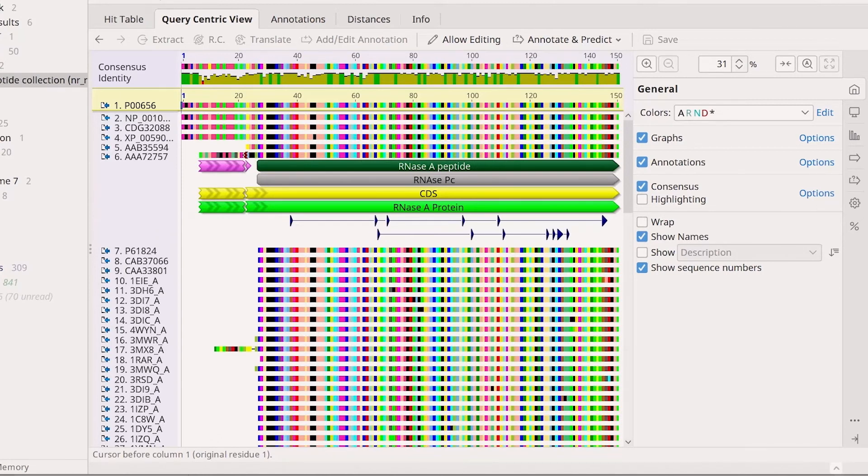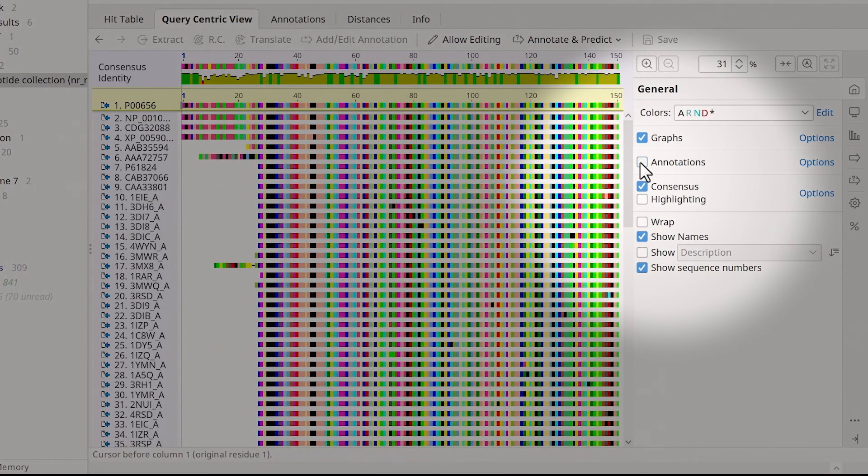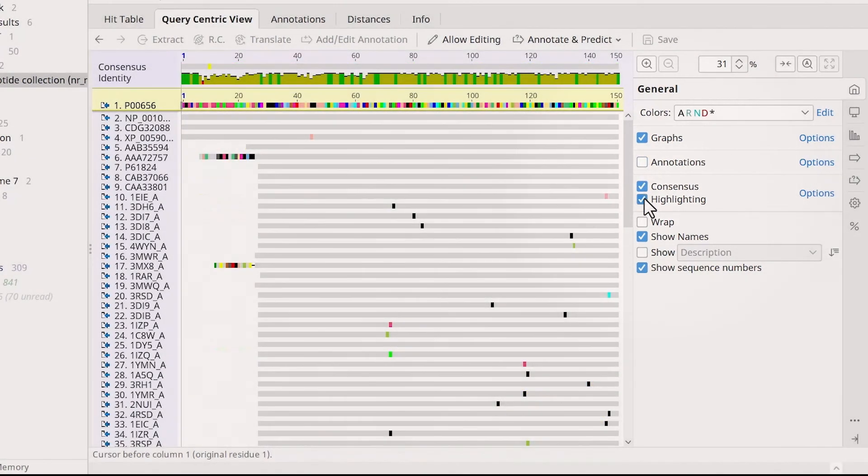The query displays in the top yellow panel, with the hits listed below. When in query-centric view, it is best to turn annotations off and adjust the display settings to apply highlighting for disagreements to the query only.